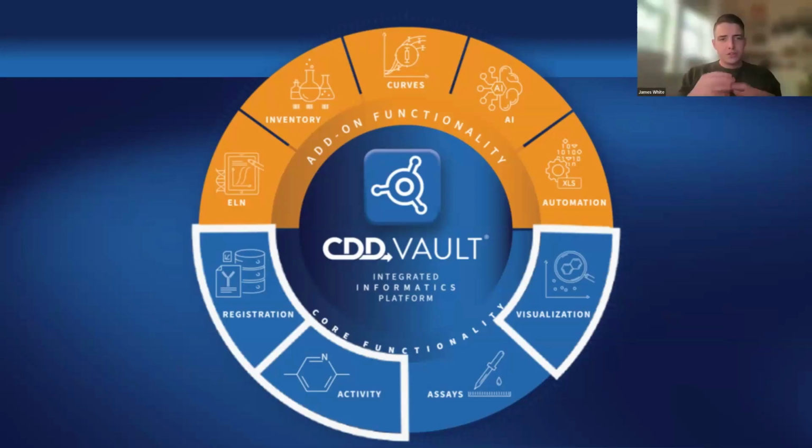We've also unified the data capture across both biologics and small molecules so your team can work in a single, consistent environment. The goal here is to reduce the friction that researchers might face with large or hybrid molecules, and these are going to bring better structure, traceability, and visualizations to support both biologics and small molecule discovery.